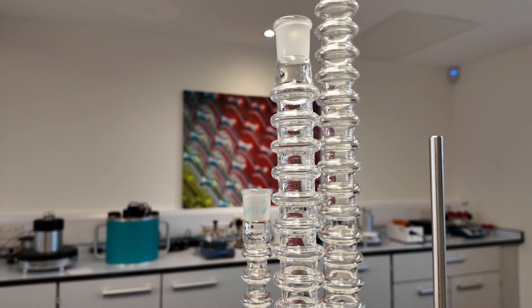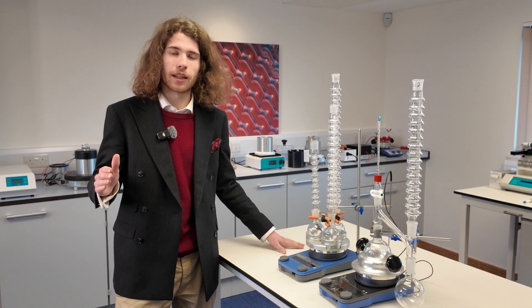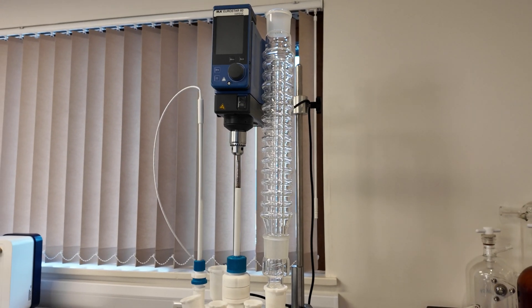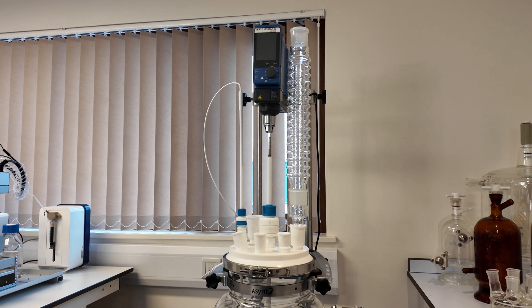The Condenser can be used from the smaller size round-bottom flasks all the way up to one litre. Above one litre round-bottom flasks, we recommend using our Condenser Maxi, which can also be used with jacketed reactor vessels.